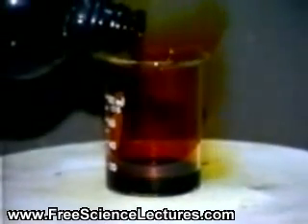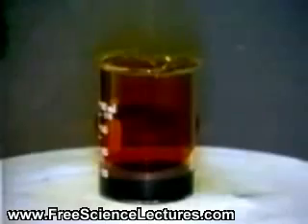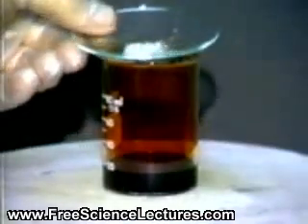First, a layer of bromine is poured into the bottom of a beaker. Then, some aluminum pellets and powdered aluminum are placed on top of the bromine.